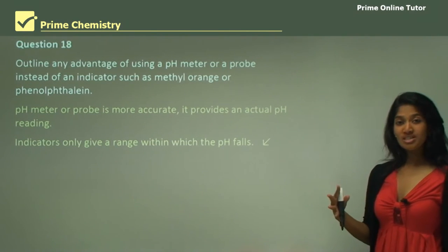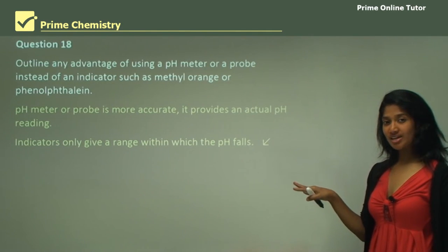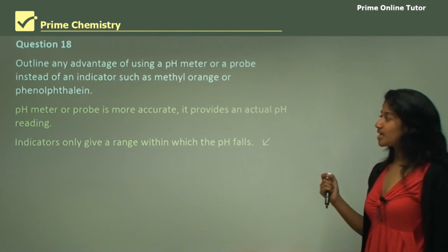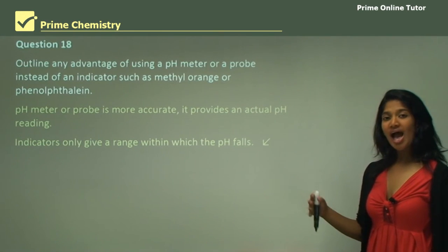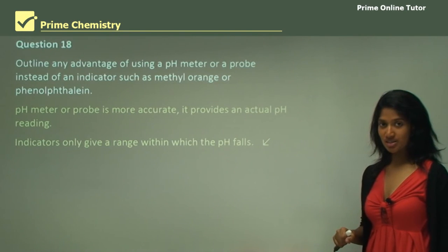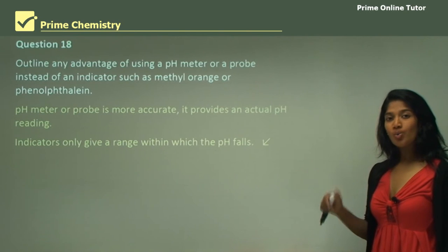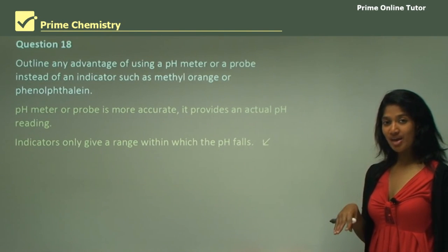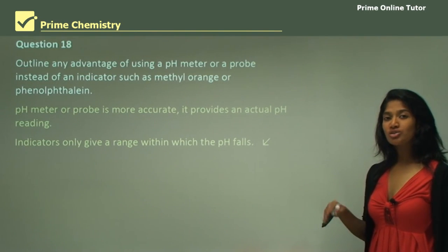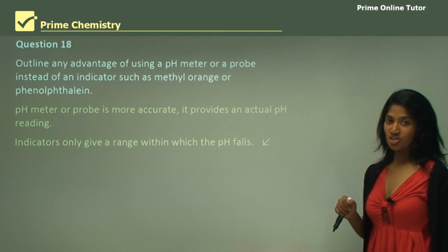Now wrapping up what we did this lesson, we went through an experiment that reflected how you can test pH of different solutions, and also we saw the basicity and acidity of household substances. During this topic of acidity and pH, we talked about how acids and bases react in water and also described what pH is and how pH varies and how you can find the pH with the hydrogen ion concentration.